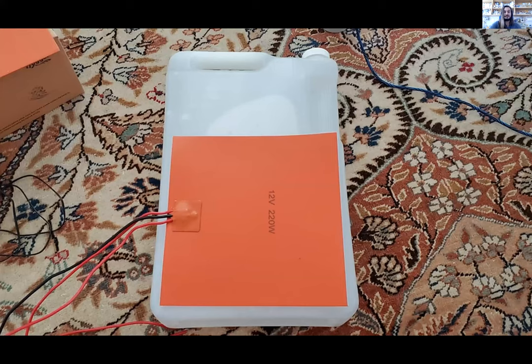Then I found this. So this was an absolute stroke of luck. I found these really awesome 3D printer heated bed platform silicone heating mats that fit perfectly around this bottle. They're 12 volts at 220 watts, so not 7 watts, 220 each. And I did the math, and that totaled to about 40 amps of power. 40 amps of current going through these things. Now, this is the highest current system I've ever built thus far. And I've never worked with high current systems, and so there's a lot of things that you need to consider.